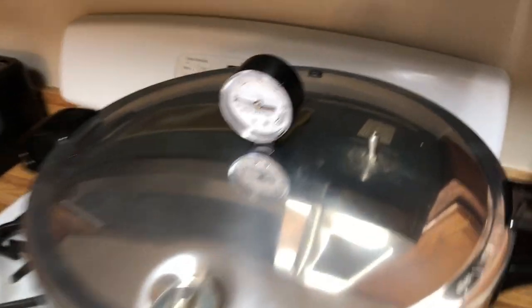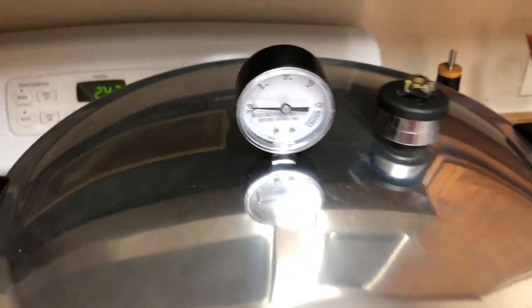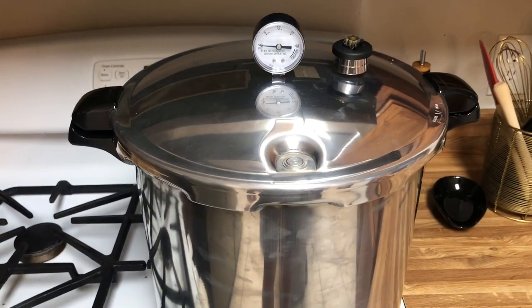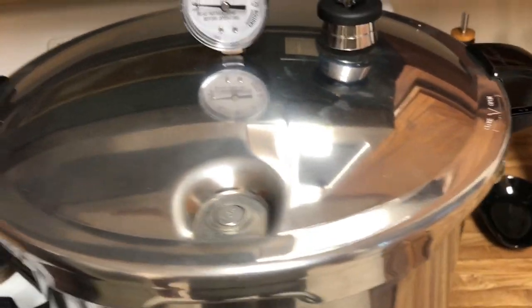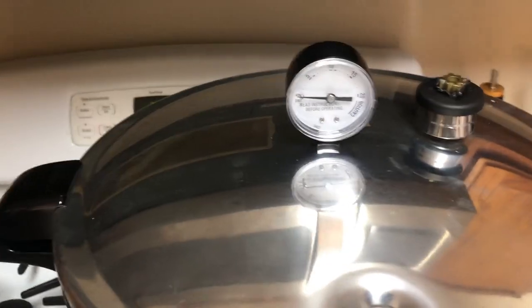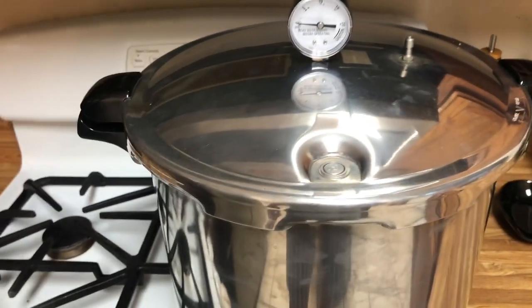So the pressure cooker has been venting for 10 minutes. Now we're going to slap the weight on here and let the pressure build up to 15 psi. Once it's done pressure cooking, I turn the heat off and then I let it sit until it gets to zero and I let the pressure all the way go down. This has been sitting for about an hour after pressure cooking. It's still hot, but it is at least cool enough to open up. So we're going to open it up and take our jars out.